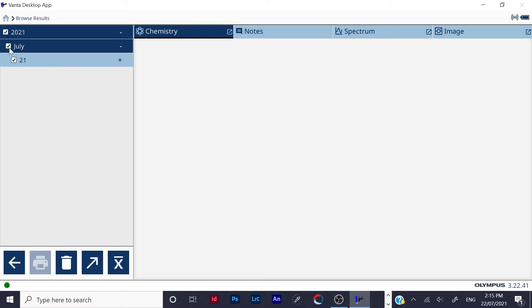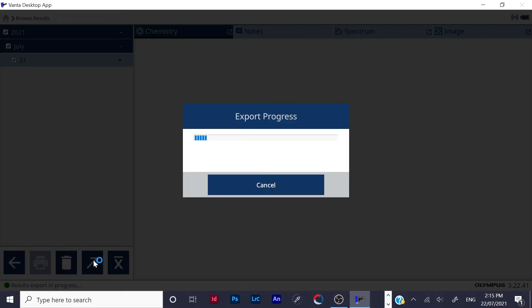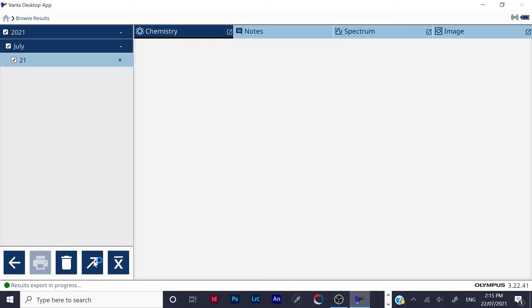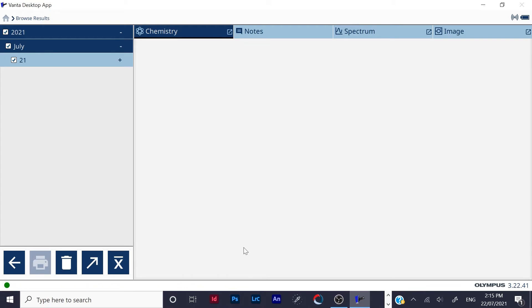And all your results will come up. Make sure they're ticked what you want to be exported. Then you click the export arrow, and the results are exported.